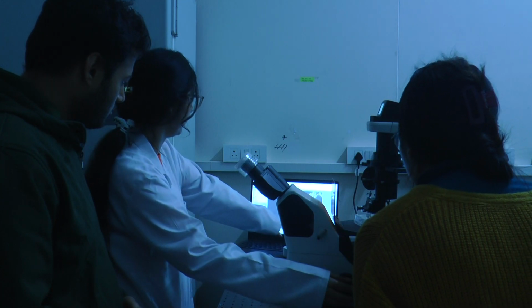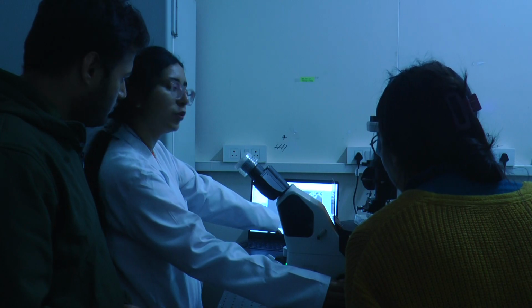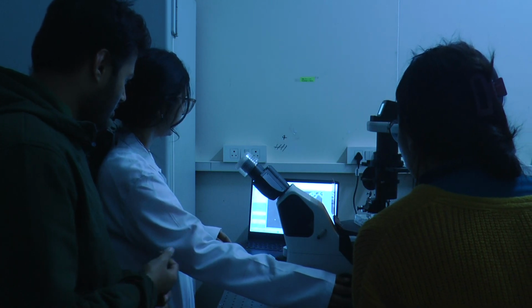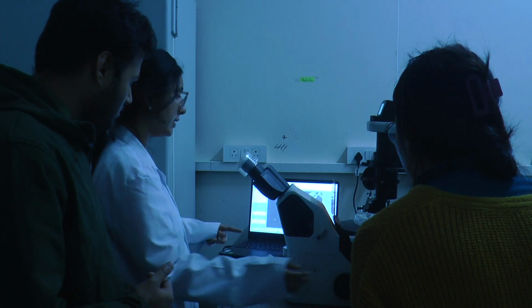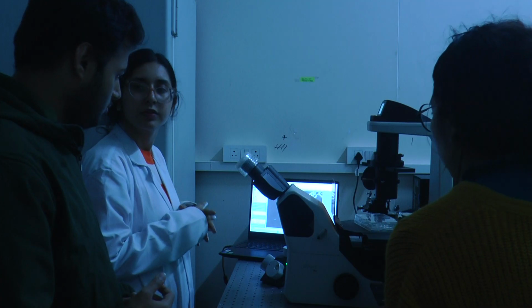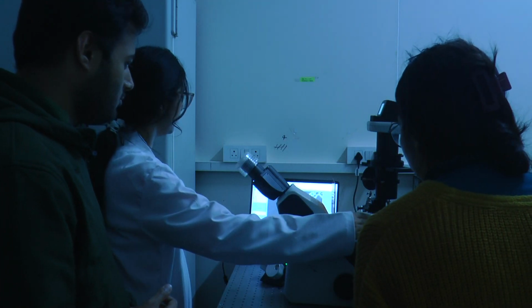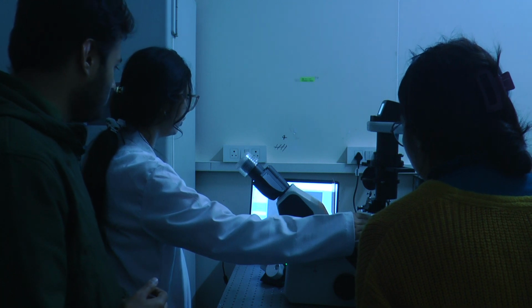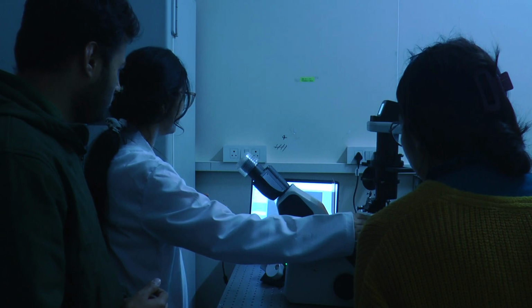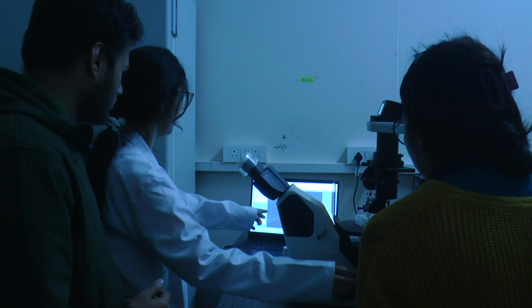Here they are. See, this is the bigger one. It's merging, so if we incubate it for more time, then we can get this. Yeah, cytoplasm, proteins, lipids, everything will be visible, just with a little higher contrast. Otherwise, in visibility, they are the same as GUVs only. See, there are so many. All these are GPMVs which are floating now.